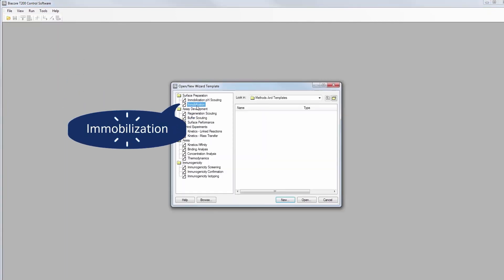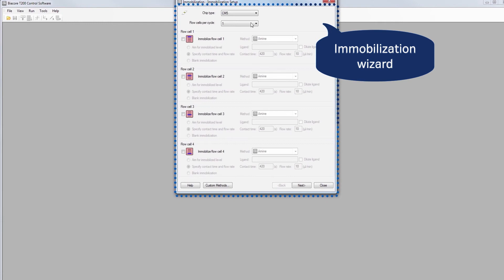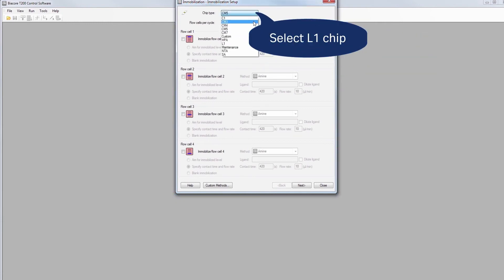Biacore software guides you through the immobilization, step by step. Start by selecting the chip type you want to use. In this case, we're going to use L1 chip.